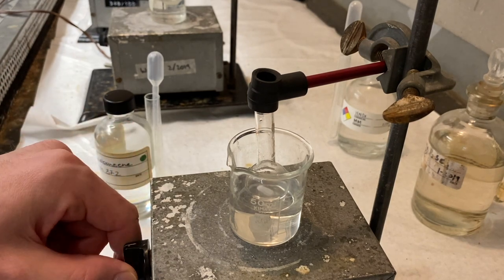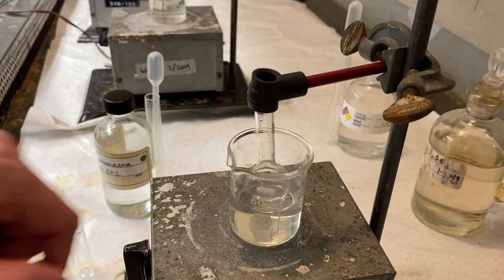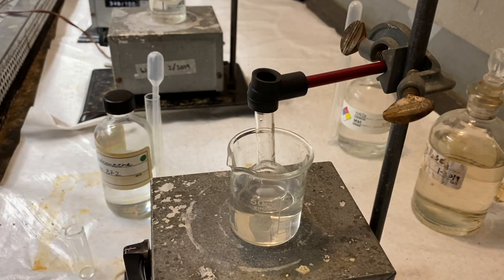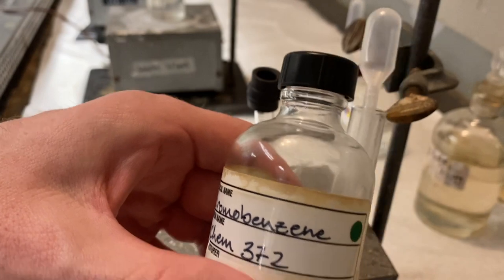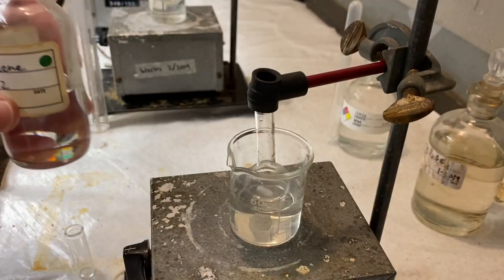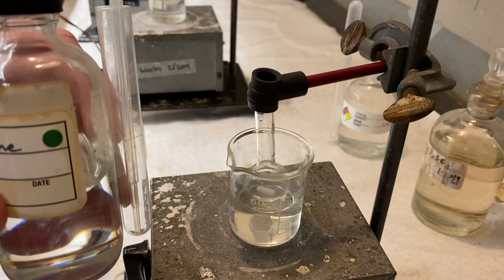We're going to go ahead and get the stirring bar going now. And at this point, we have our bromobenzene. And we're going to add this dropwise.